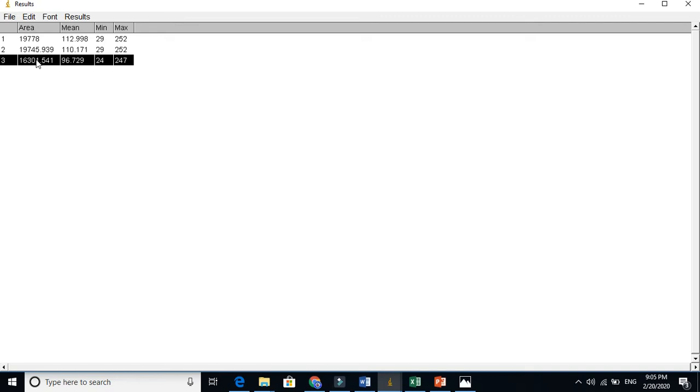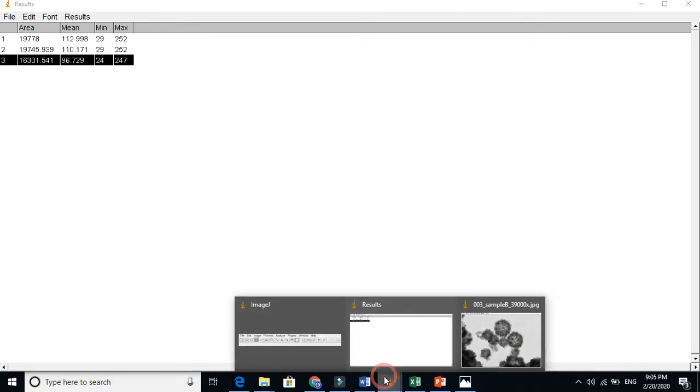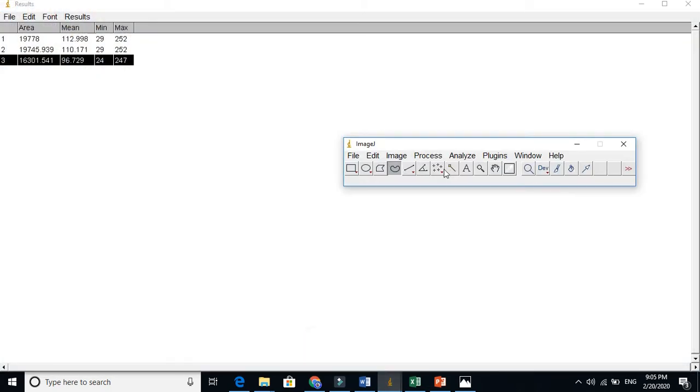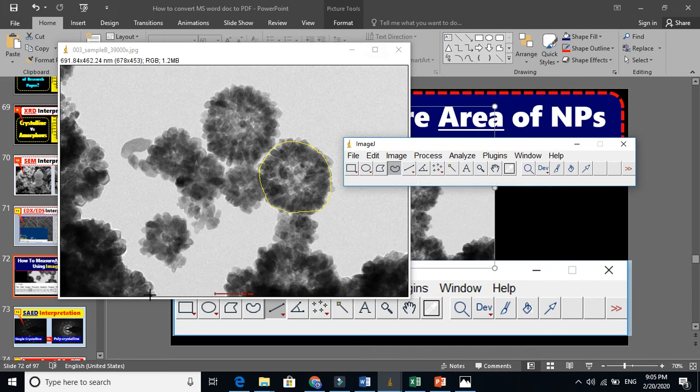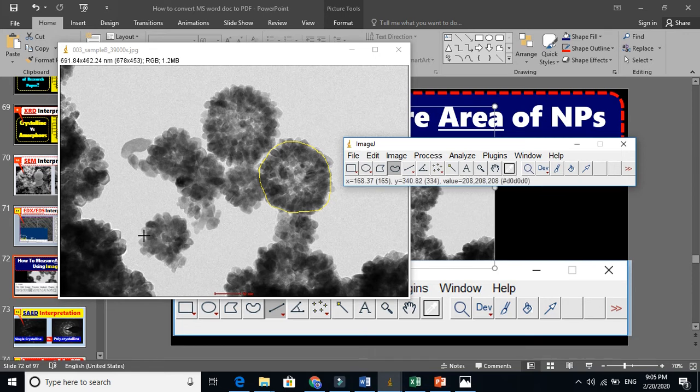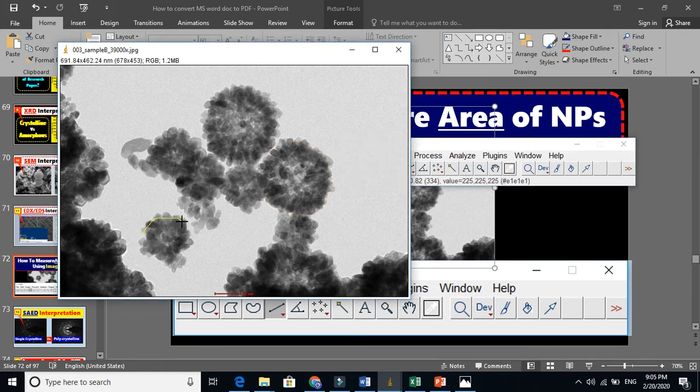You can convert this into meter squared or nanometer squared. This is how you can find the area of a nanomaterial or nanoparticles. If we take this smaller one, you will see that the area will be very small comparatively.